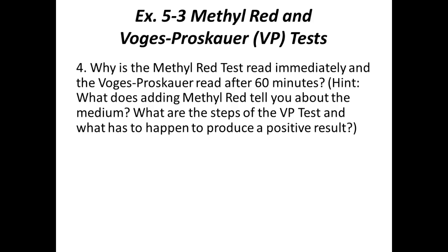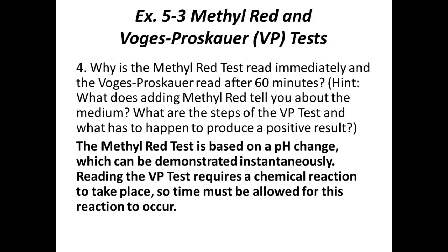And chemical reactions sometimes take time, right? Hence the waiting. Although you want things to go faster sometimes, it's just not possible. Although, as you saw, most of our organisms, within 20 minutes, they turn positive. And some as early as 10 minutes, we were able to see our results.